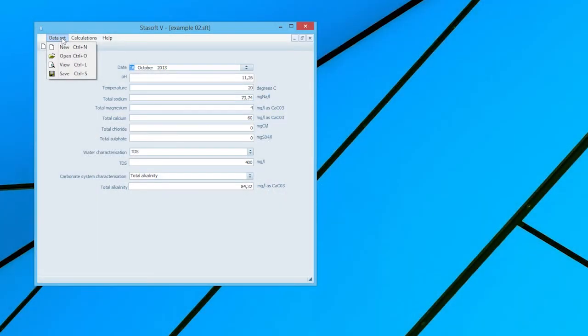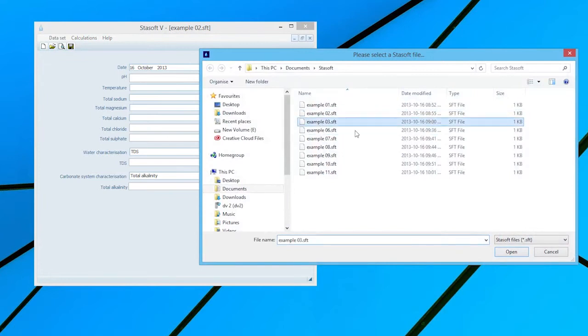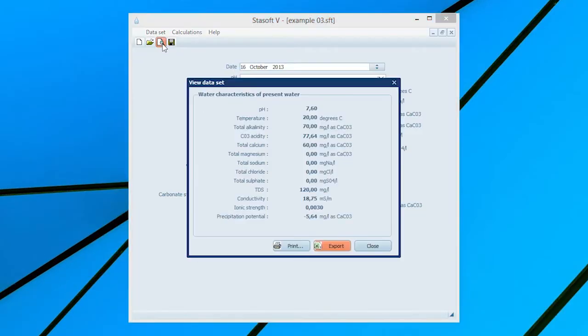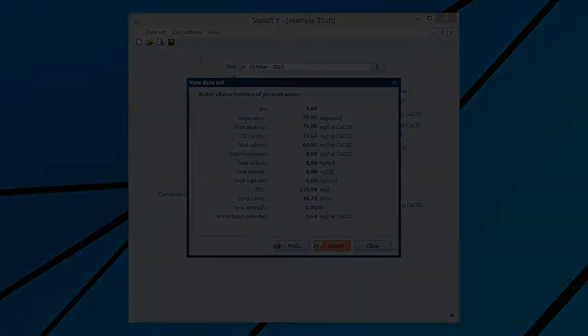Stabilizing water to a specified calcium carbonate precipitation potential using lime. Select Data Set 3 for Example 3 in the manual. The selection of the View option will bring up the window displaying the characteristics for the present water onto the screen.